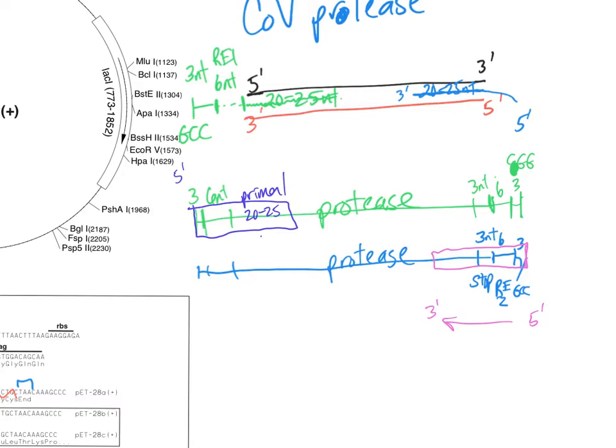of DNA, but then once we actually decide we're going to end up cutting this, what we have then is it's going to cut somewhere in here, here, somewhere in here, and I will get my sticky ends from my 2 restriction enzyme sites there.